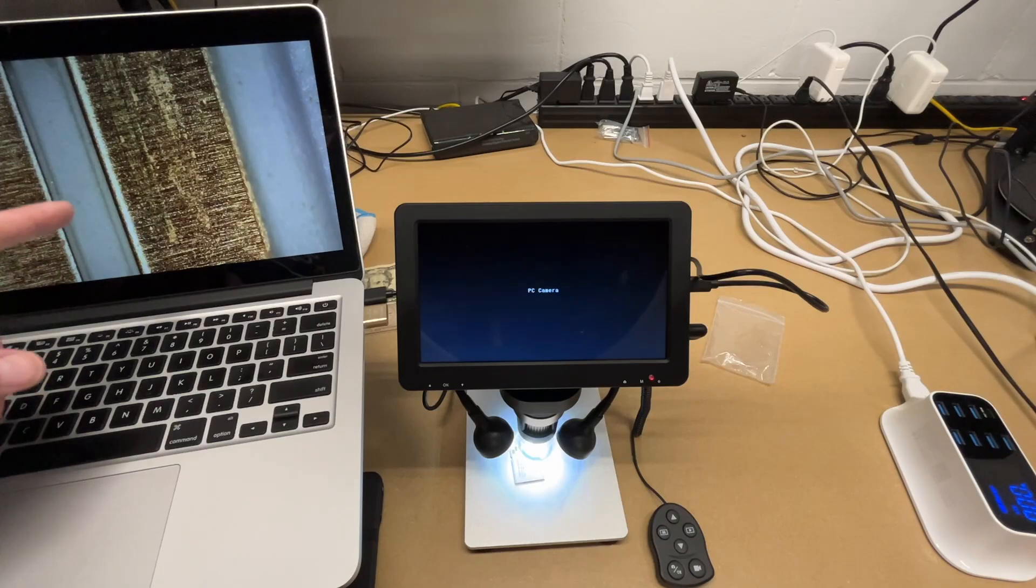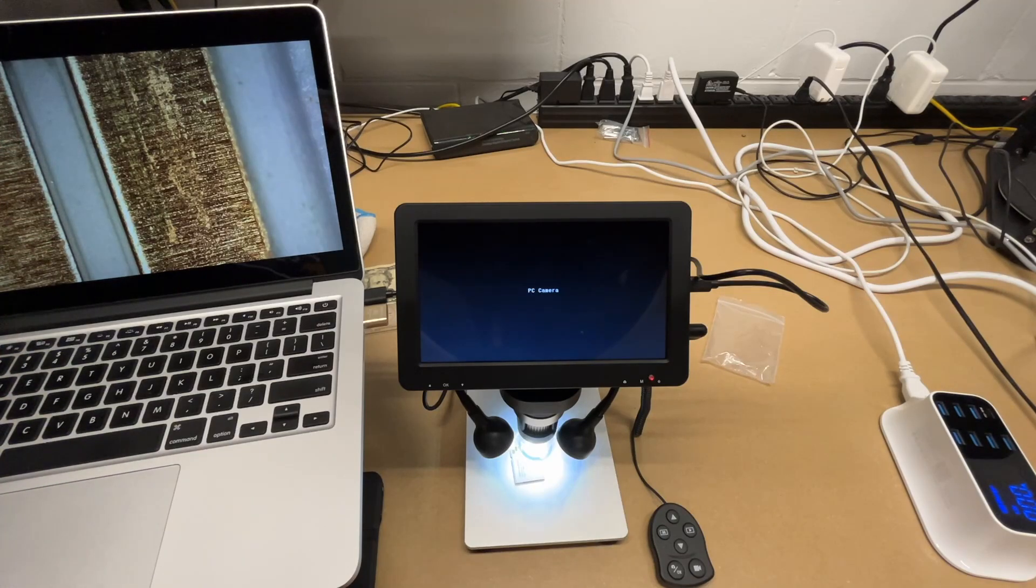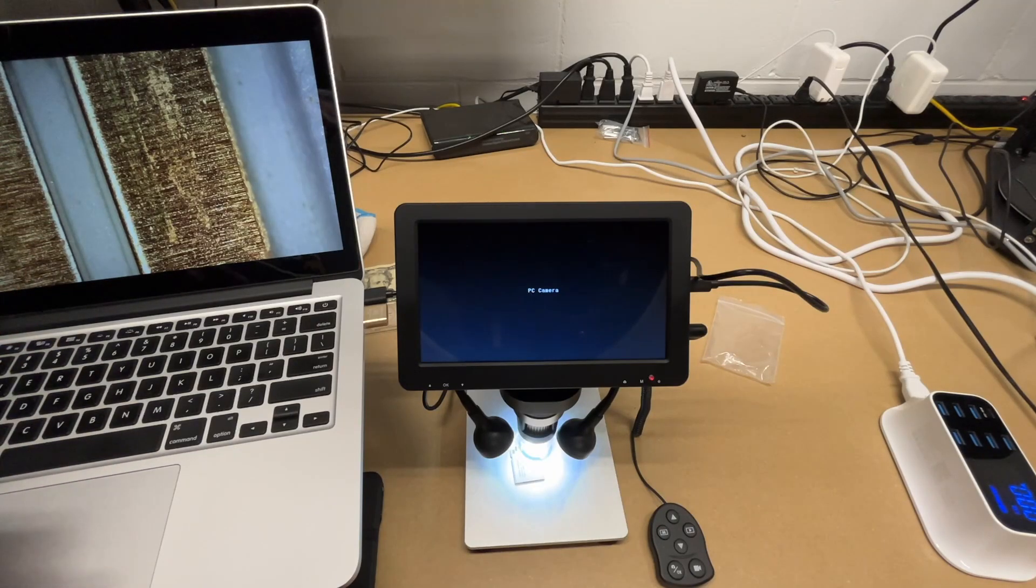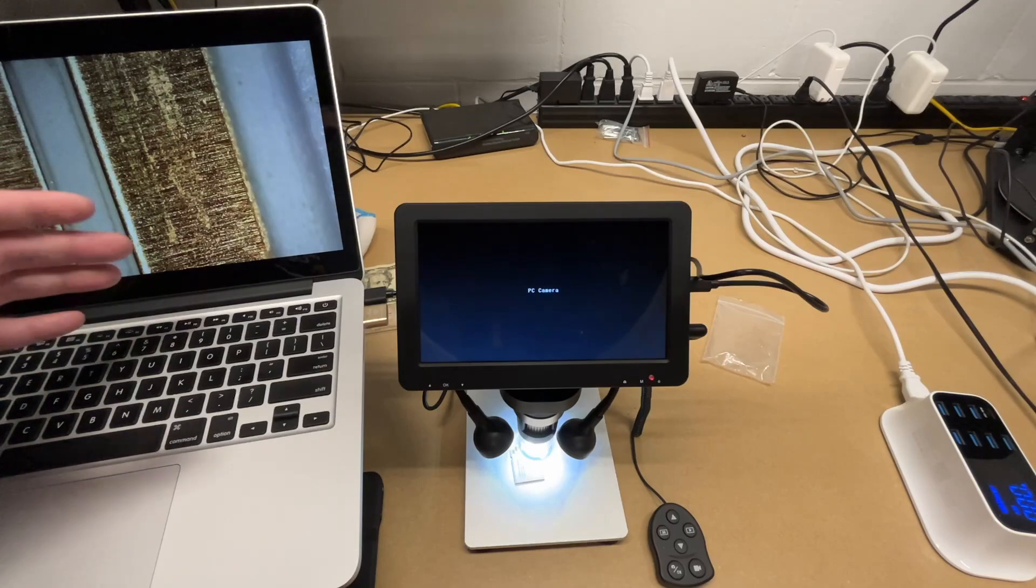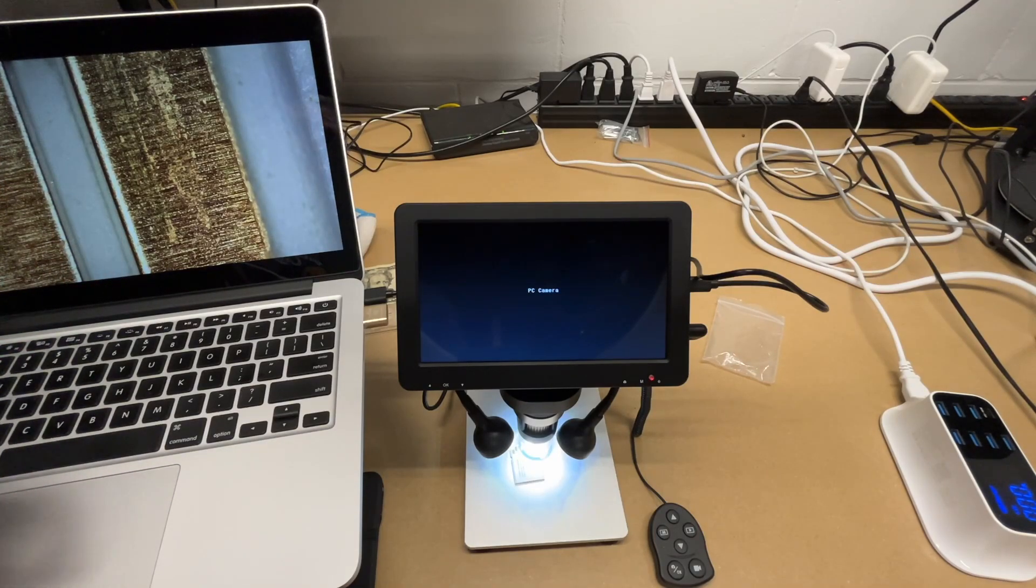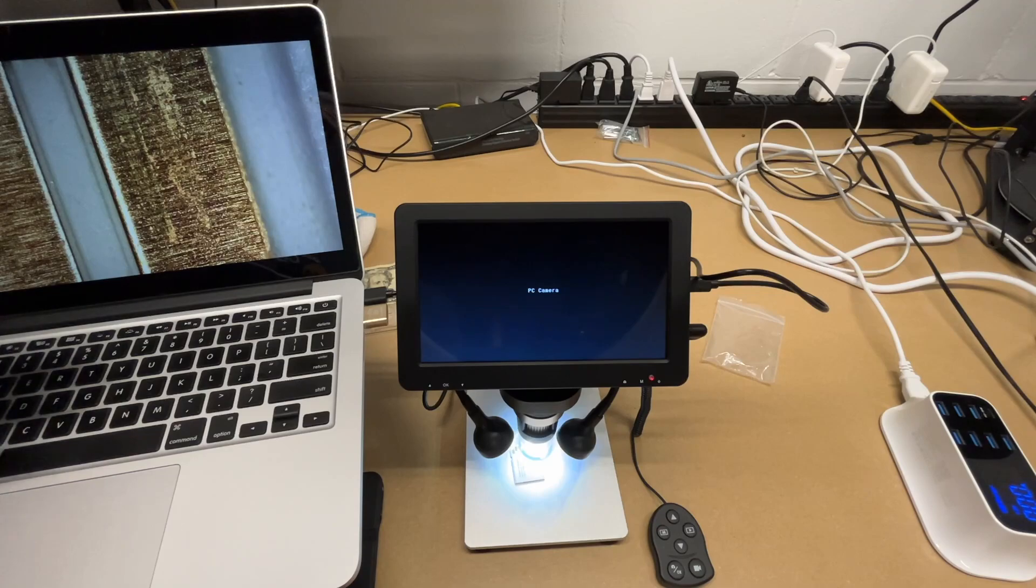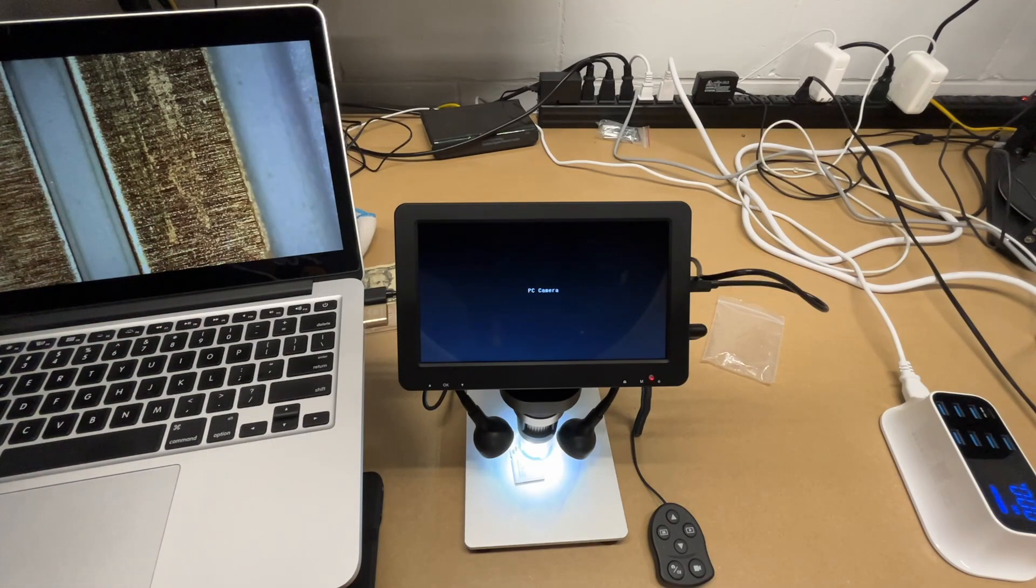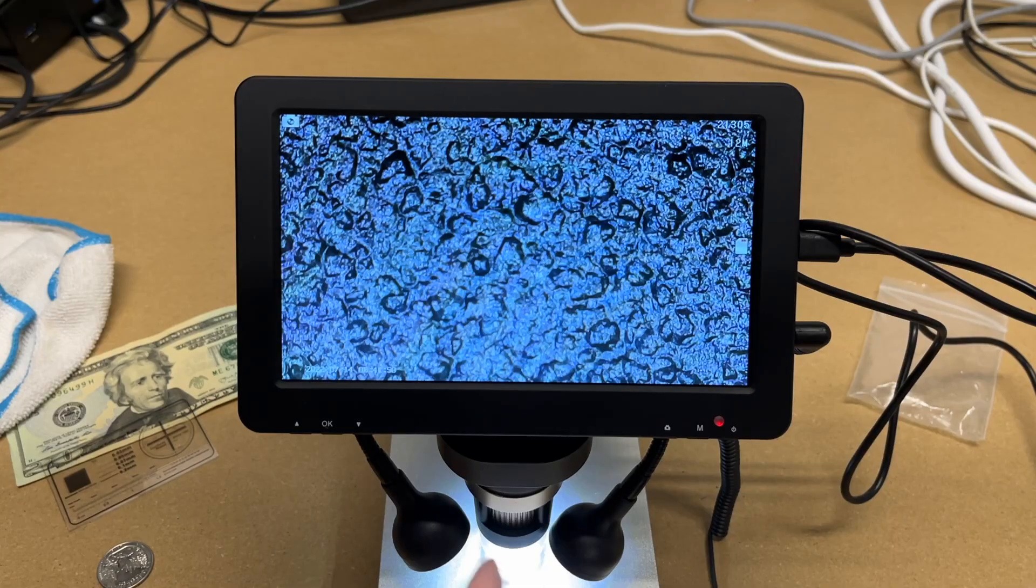And of course you could record this on the computer too. So if you're on Windows, you can use the PC camera software. You could also hook this into a Raspberry Pi computer or any other device that supports regular webcams. There might be some TVs that support webcams. And if that's the case, you could plug this into it and display the picture right on it.